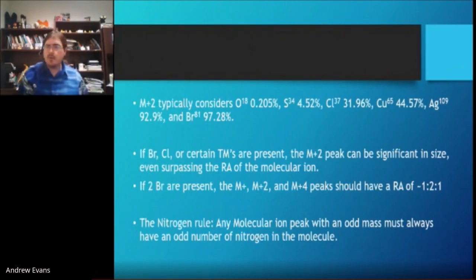Every other compound typically has either an even molar mass and can make an even number of bonds, or an odd molar mass and can make an odd number of bonds. And whenever it has an odd molar mass and an odd number of bonds, it results in an even molar mass for the overall structure. Only nitrogen, with its 14 molar mass and making 3 bonds, creates this unusual dichotomy.